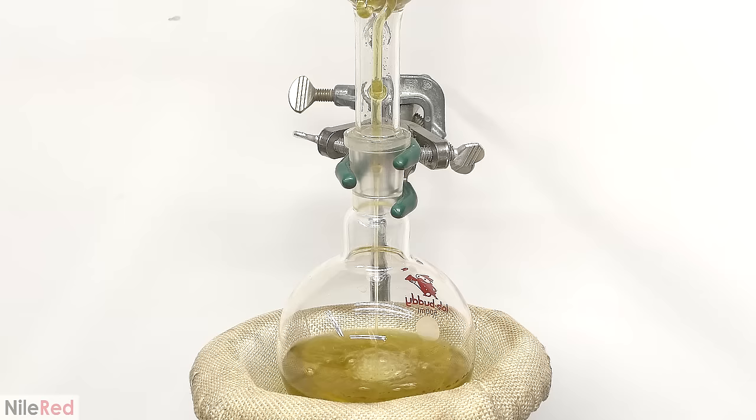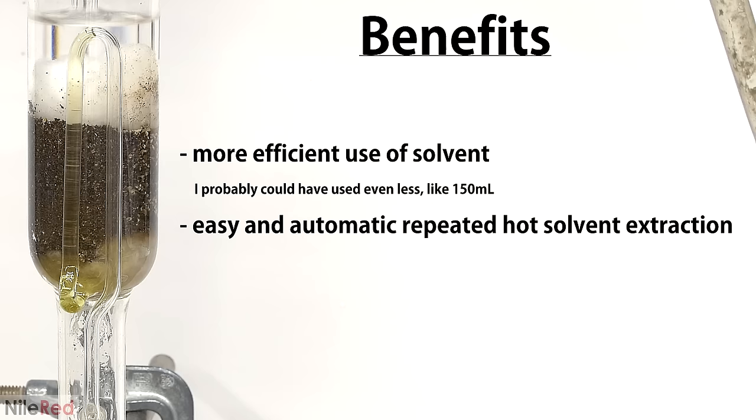All of the solvent is dumped into the flask below with the rest of the alcohol. This marks the end of one cycle and in theory we can cycle it as many times as we want. For this extraction, I'm only going to do it for two hours, but there are preparations that require several hours or even days.